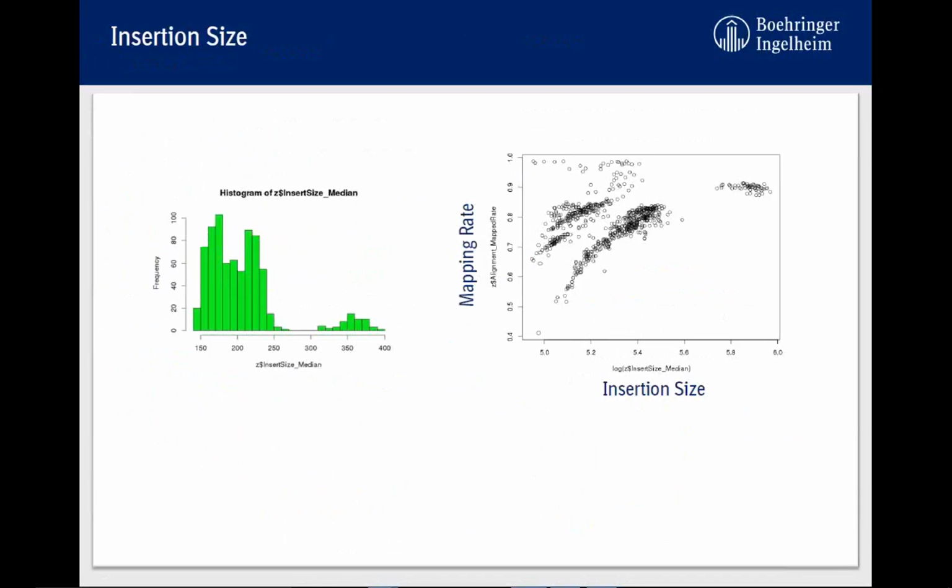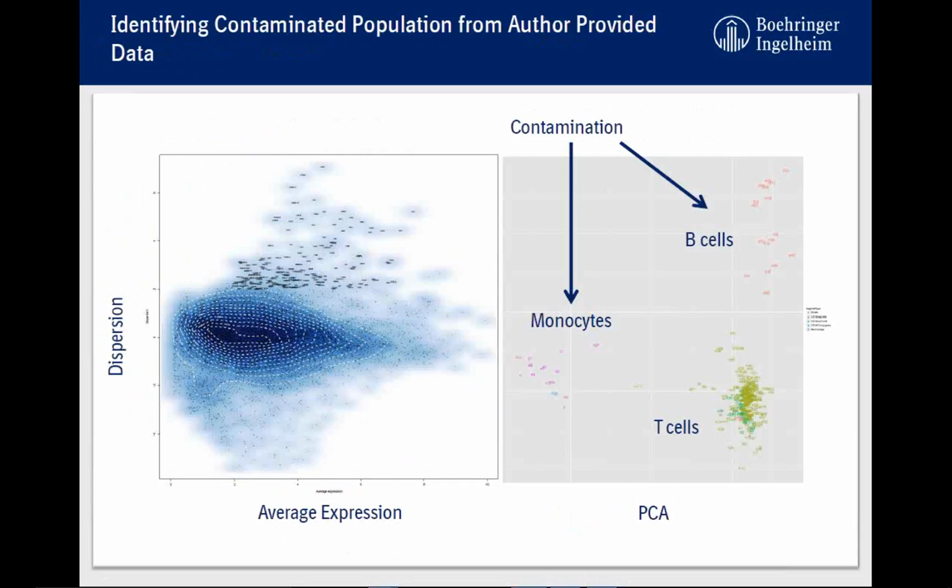And then we really go back to the data. We found out they merged different batches. So a single-cell RNA-seq batch effect is a major issue. I think that's great. We know the QC and we have these reasonable data sets. We want to remove some low quality data. We put them together. This is the common way we do analysis.